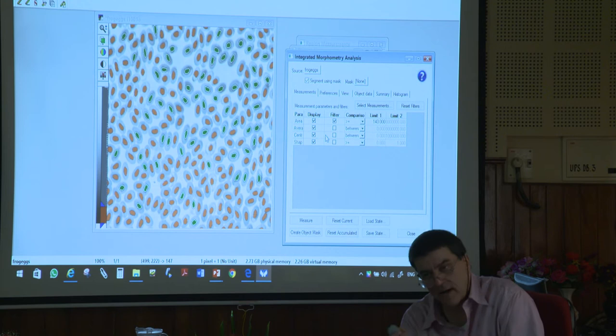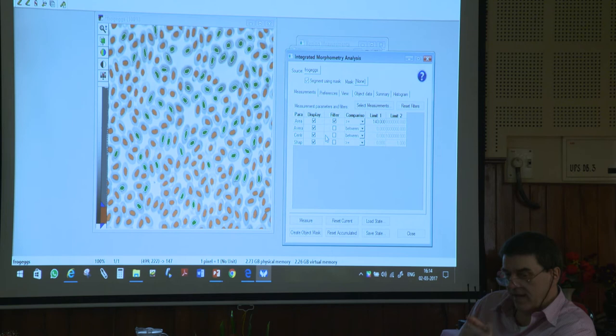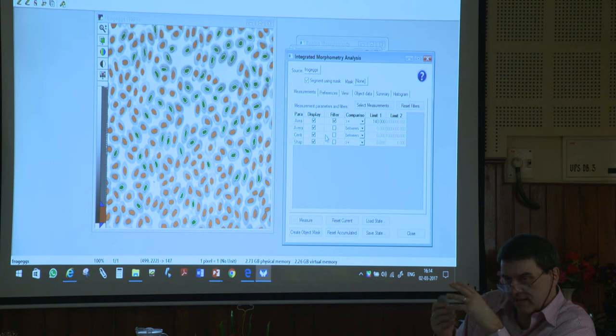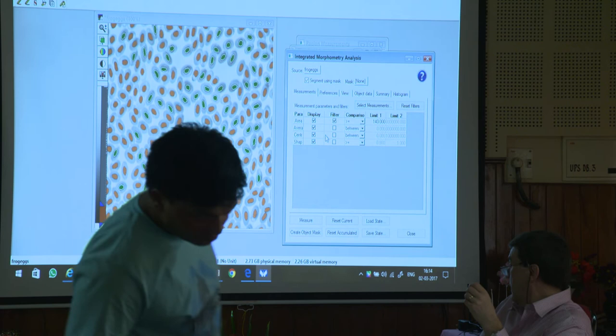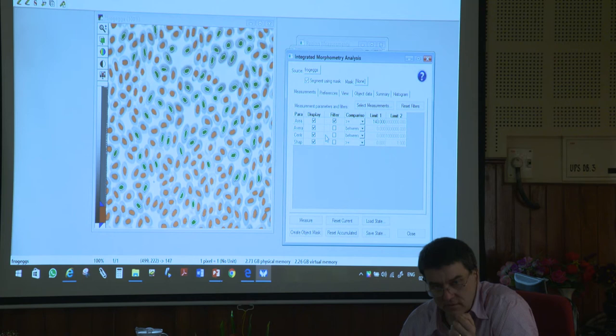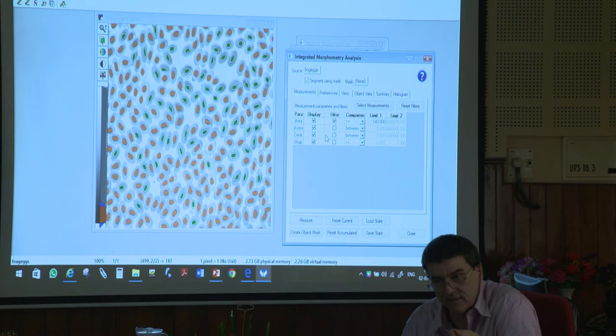And sometimes I'll actually use shape factor and area. So I'll sort by shape and I'll sort by size, just trying to tease out what I want to get, okay? Depends what the question is, depends what I'm looking for. So I'll do that like that, okay? Any questions? Does this sort of make sense what I'm trying to do? I'm trying to show you can sort by more than just intensity. You can sort by intensity too. Yeah, you can sort by shape.